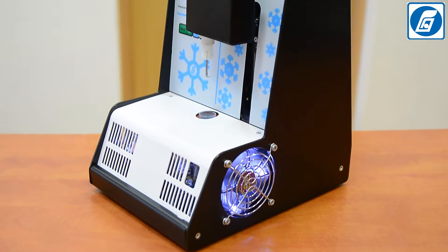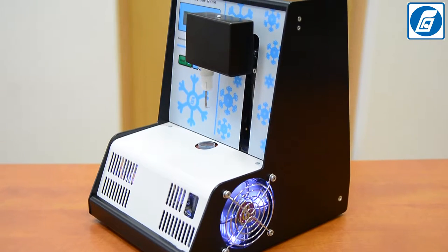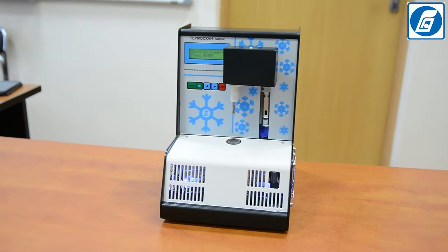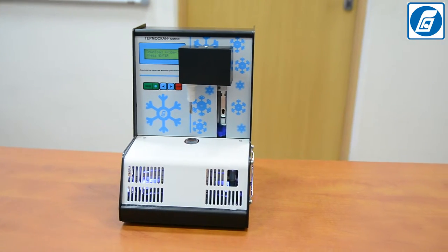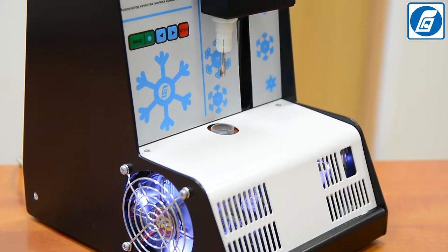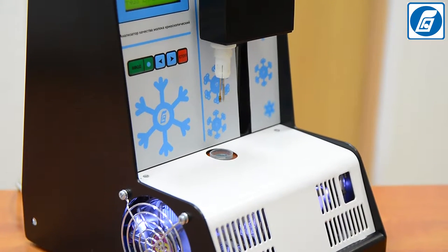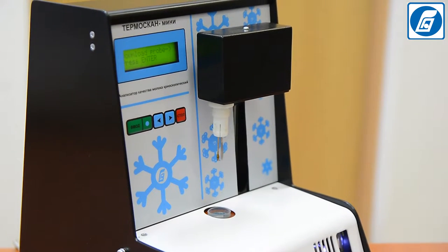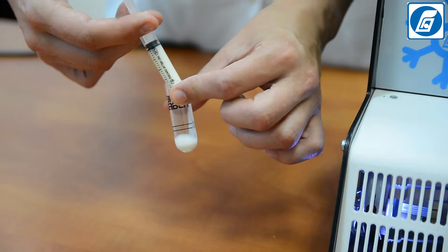Key advantages of our product: suitable for raw and processed milk, high accuracy of measurement, simple sample preparation, small consumption of milk for samples, reliability, affordable price, short payback period, and doesn't require daily calibration.